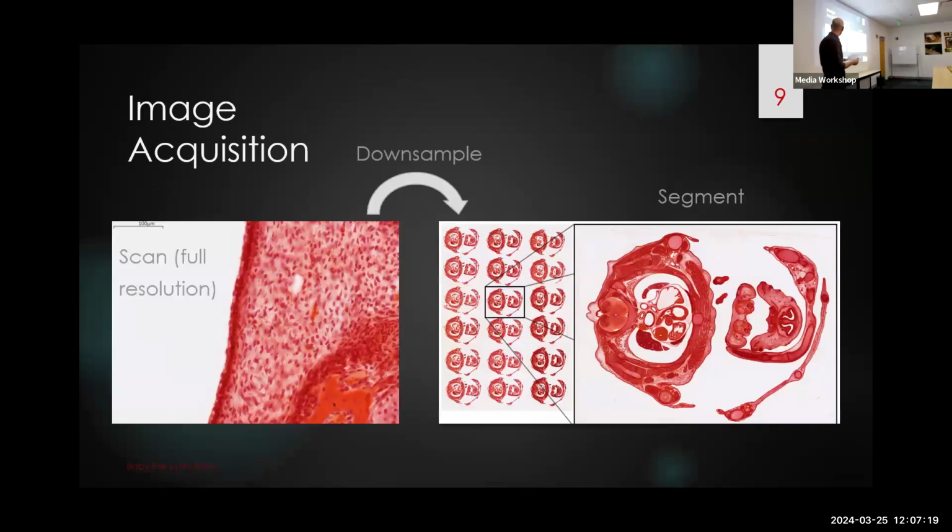Image acquisition is the first part of the process. Though the scans were done at very high resolution, this need not be part of the reconstruction process. The scan images were significantly downsampled, then individual slice images were segmented out manually. All credit goes to my colleague, Emily Blank, for this patient work. I think going into the future, I would want to look into some machine learning alternatives for doing it, because it's very time consuming.